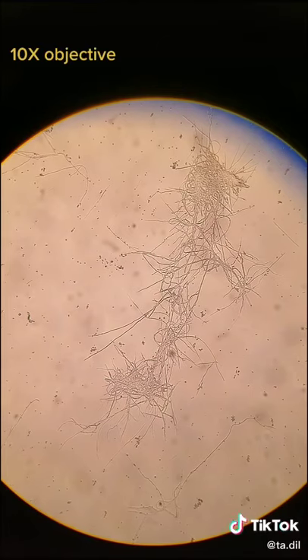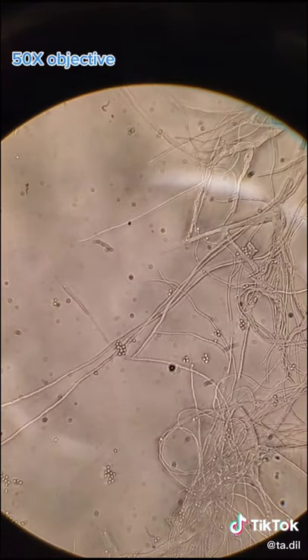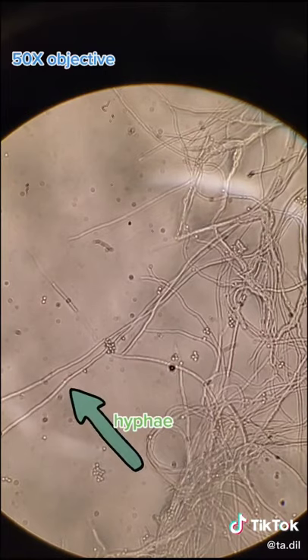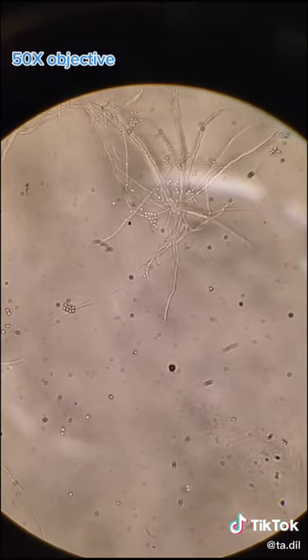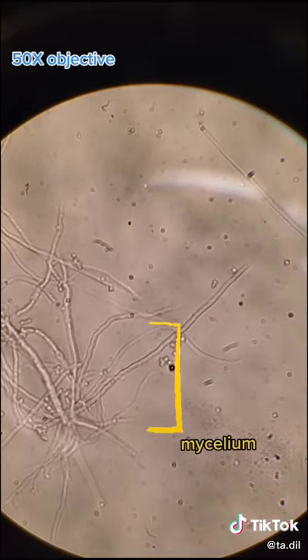Viewing sample two with the 10x objective we can see more structures. Looking closer we can see spores, but also hyphae which look like individual branches. These are responsible for absorbing nutrients from the environment and transporting them around the fungus. A collection of hyphae makes up the mycelium or vegetative part of the fungus.